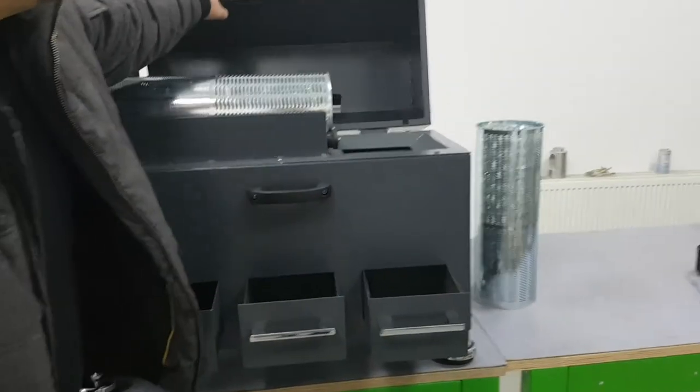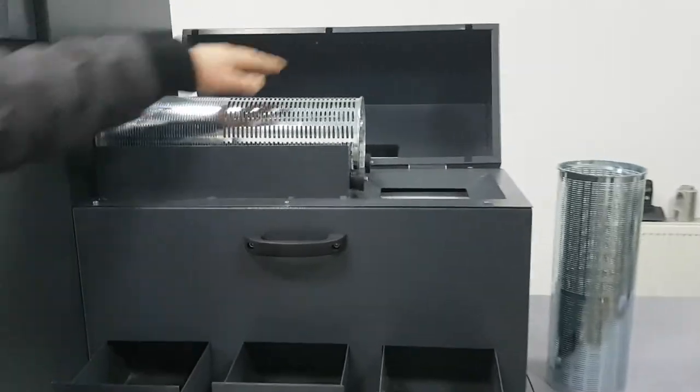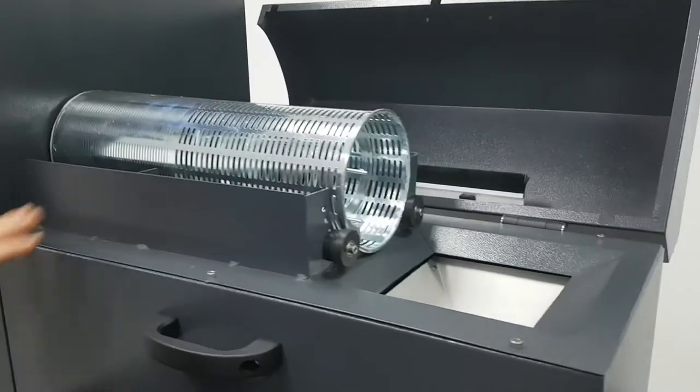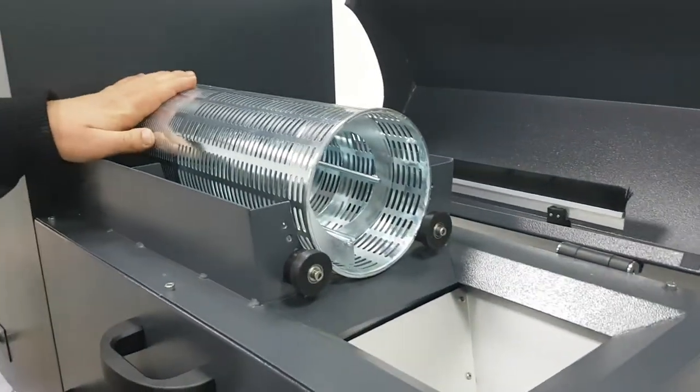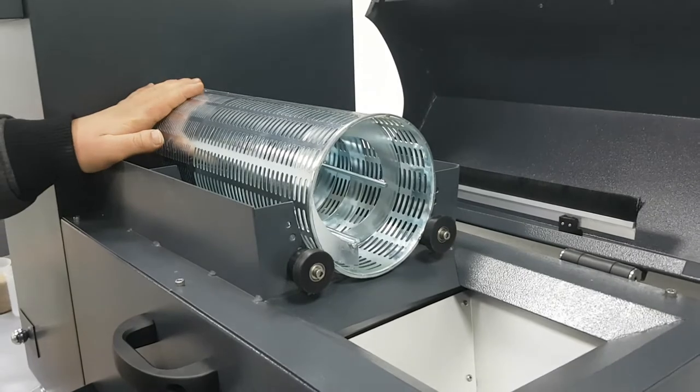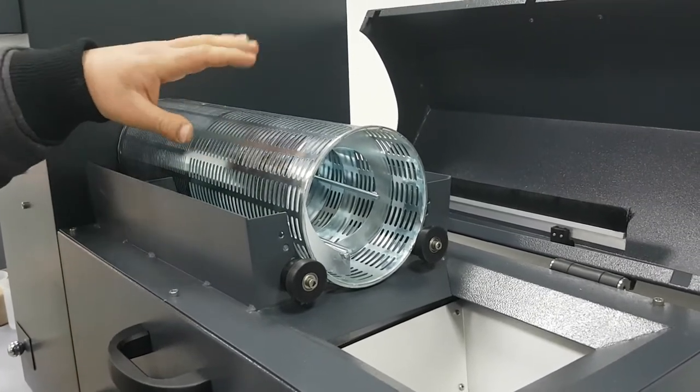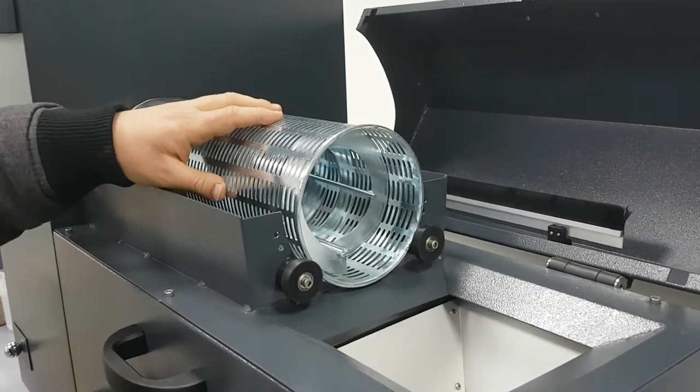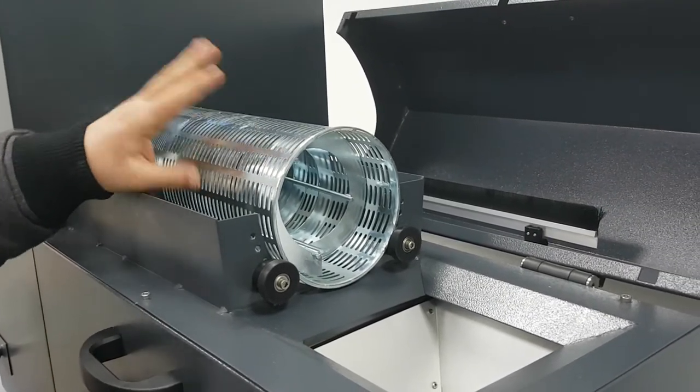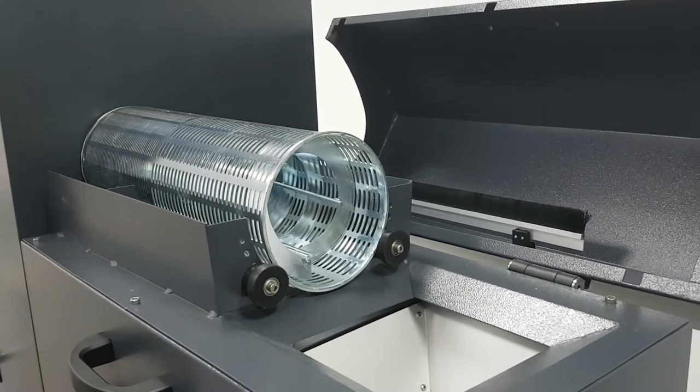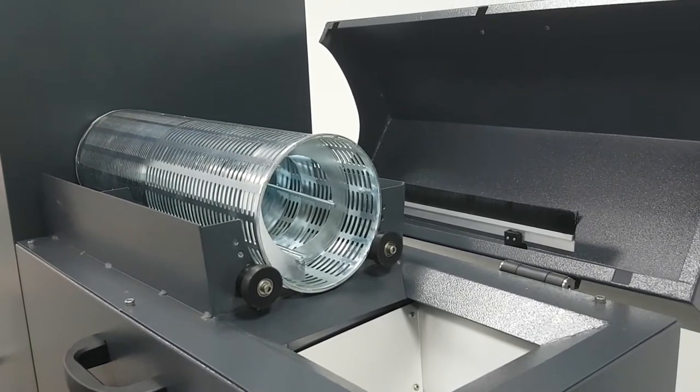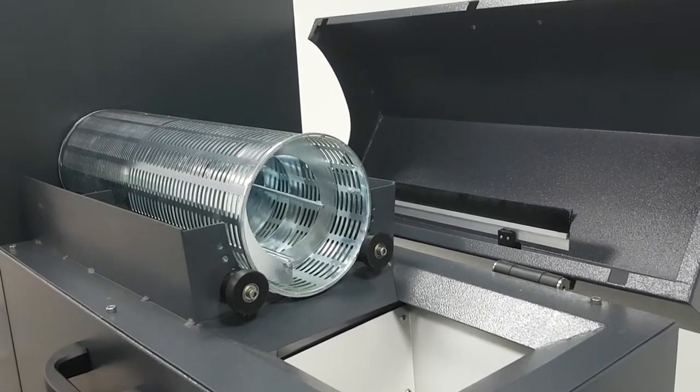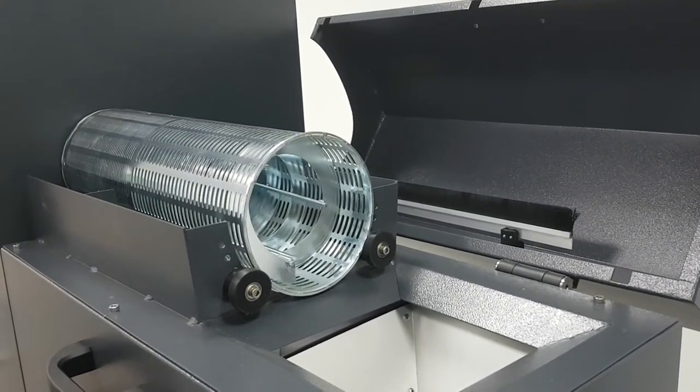Inside we have the sieves, cylinder sieves: 1.1 x 20mm and 3.55 x 20mm sieves. This is the ISO standard.